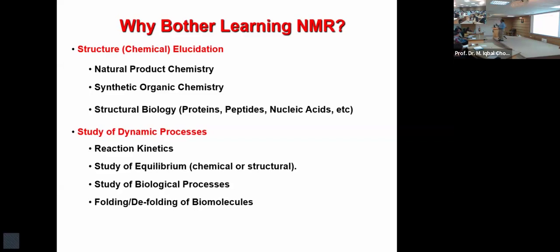And X-ray, you shine X-ray and within seconds you have a diffraction pattern. It is only NMR which is slow, so slow that you can have your experiment done in an NMR tube and slowly see the substrates or reactants diminishing, their signals coming down, and the products appearing. Because it is slow.